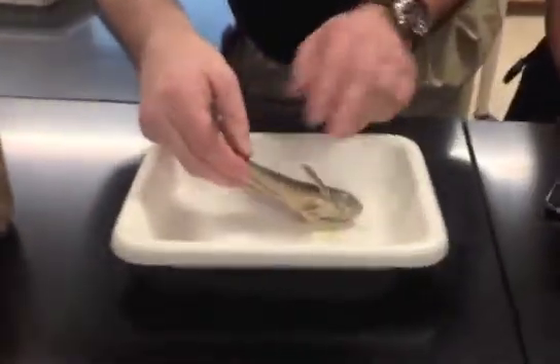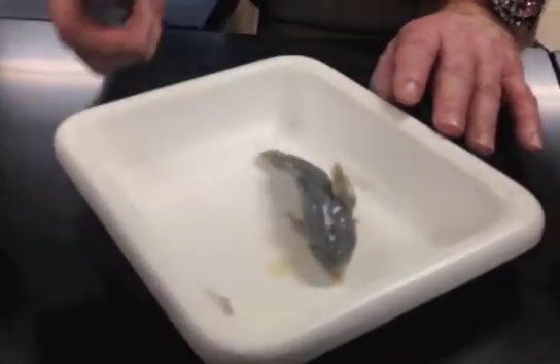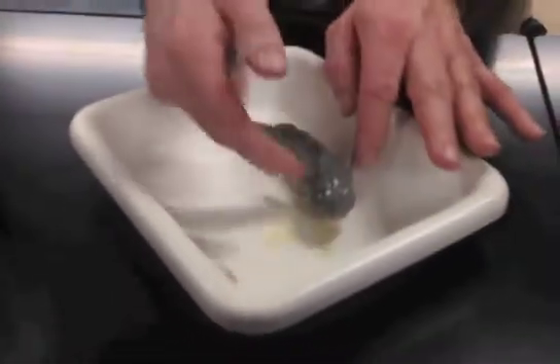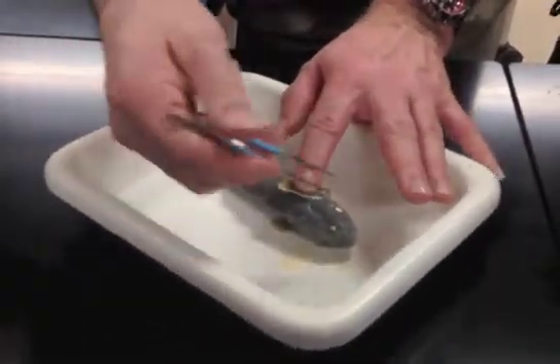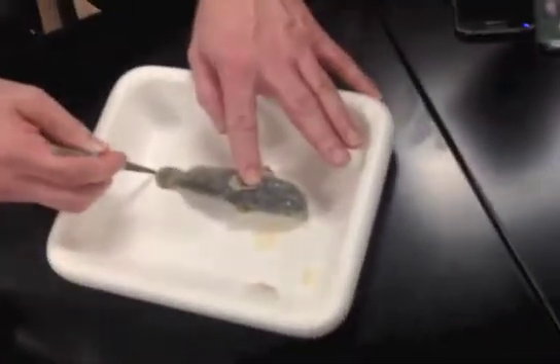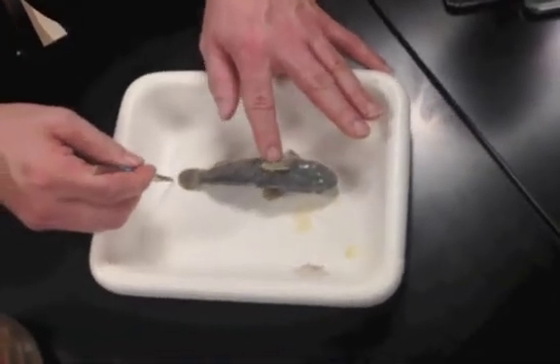What we're going to do is lay our specimen with the left side up — that is the anatomically correct side. Then we're going to measure from the tip of the snout to the very tip of the tail in a straight line. That is total length.